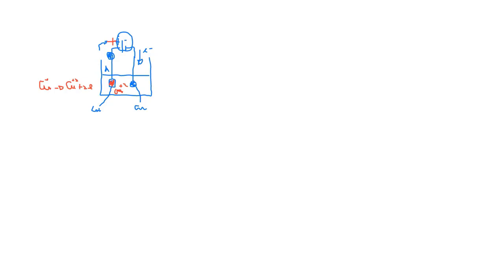So for the copper that is connected to the positive end, before we apply any current, we take the mass of that piece of copper. Then we apply a current for about 5 minutes, dry it again, and take the mass again. We record the weight loss of this metal connected to the positive end. We repeat this process 5 times.